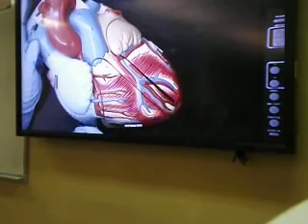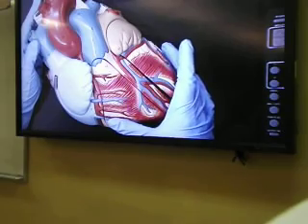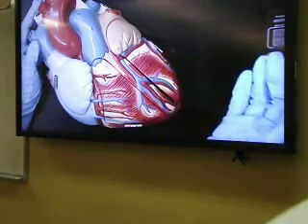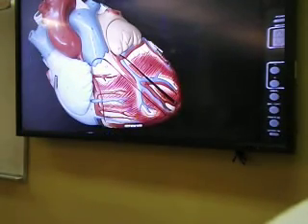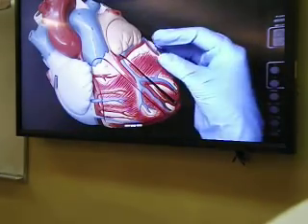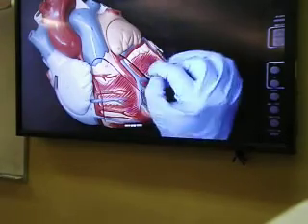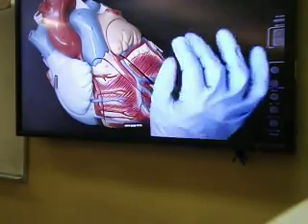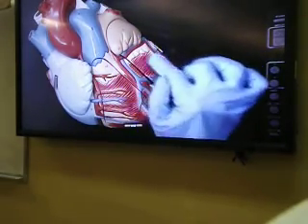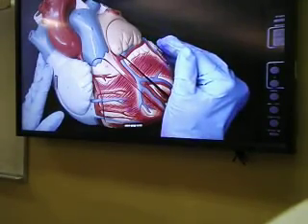So today when we look at the sheep heart in a few minutes, we will not be able to find the parietal pericardium because the heart is already taken out of that parietal pericardium. But we will see a little bit of visceral pericardium, and if it is present, it will look like a whitish thin membrane-like structure just on top of the heart muscle, which is the myocardium made by cardiac muscle.